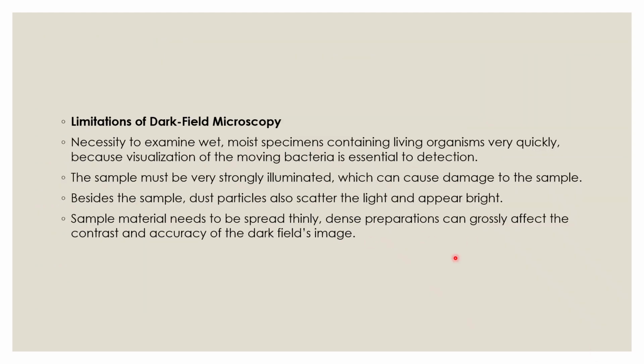Now coming to the limitations of the dark field microscope. Sometimes what happens is, when the sample is illuminated very strongly, that is when the light scattering is done a lot, there is a chance that the sample might get distorted or damaged.